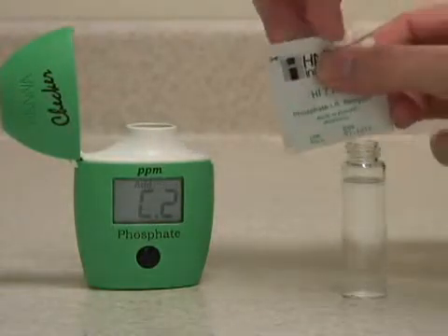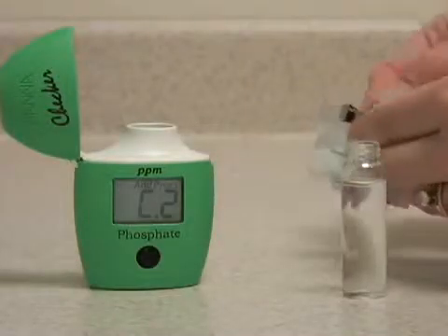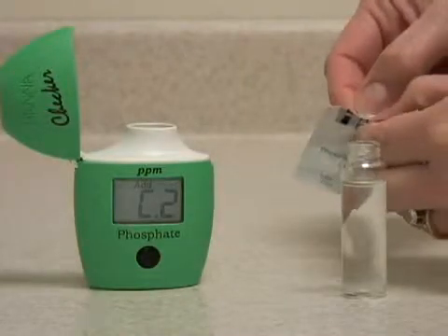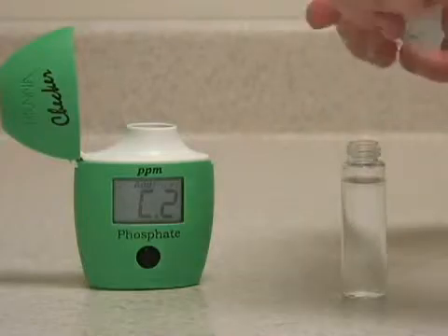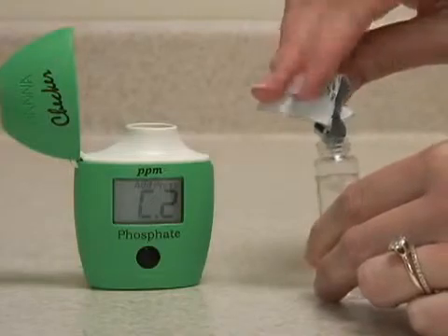So you take your Hanna Instruments Powder Pack for Phosphate. You want to pour this powder reagent into the vial. Try and get as much into it as possible.